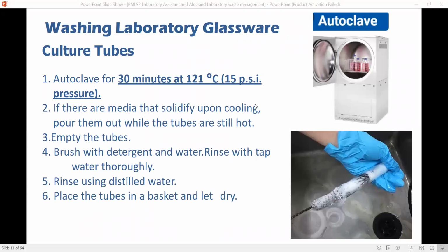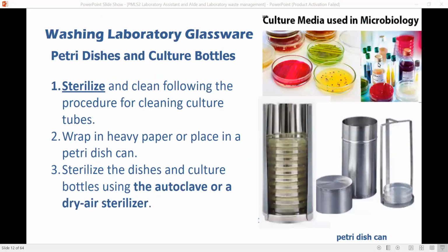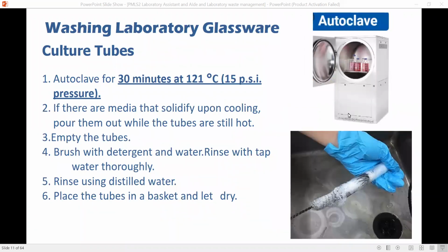Now, the problem now is how to wash the culture tubes. Syempre, yung mga tubes natin from microbiology, culture. Yung blood, mga culture natin, hindi lang blood. Iba-ibang klaseng specimens pwedeng i-culture. So paano natin yan iwawash? Syempre may microorganisms yan, right?